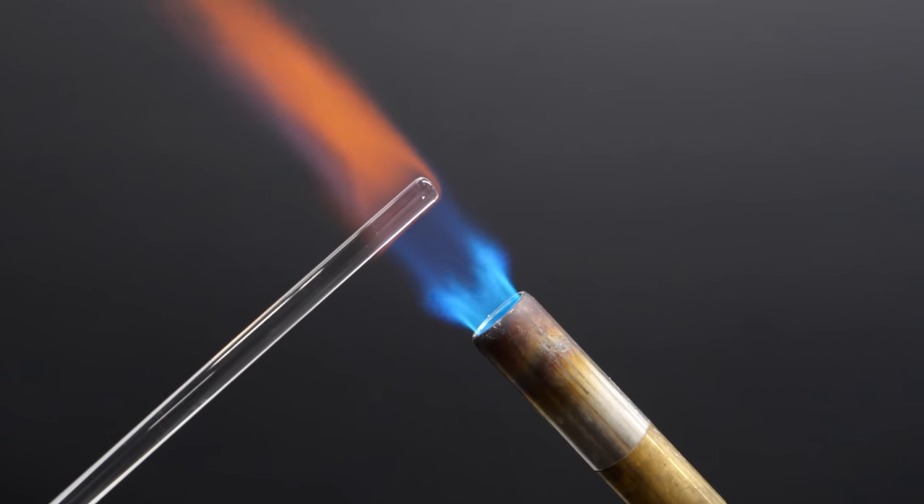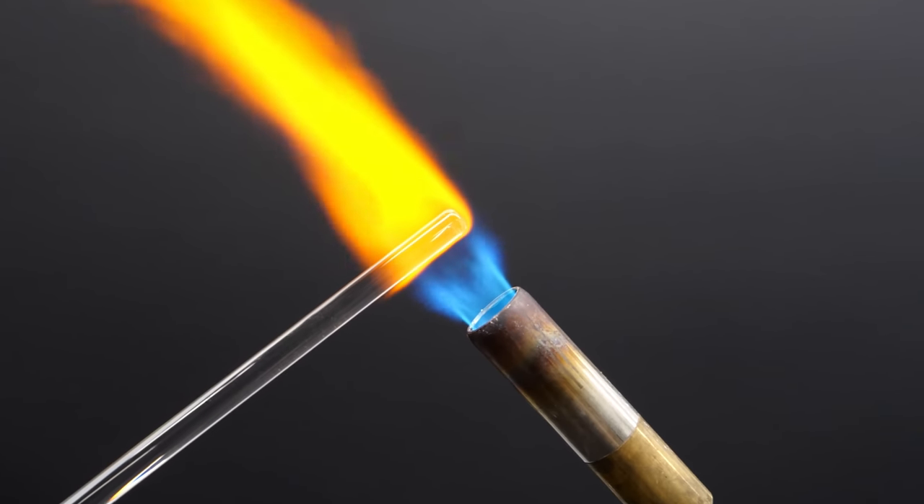So this time, I made sure to heat it until it was red hot and on the verge of melting.